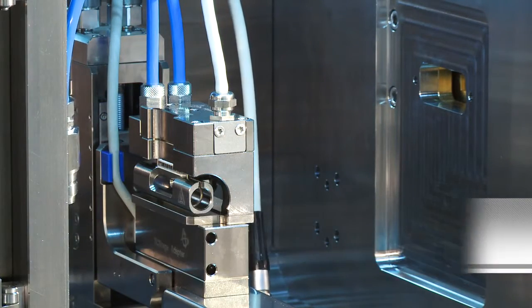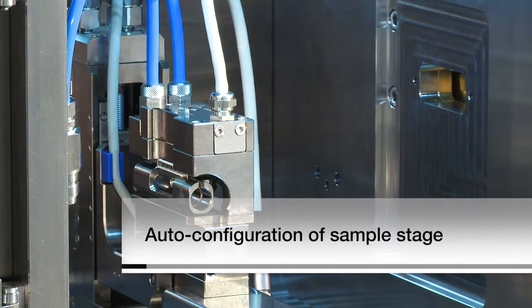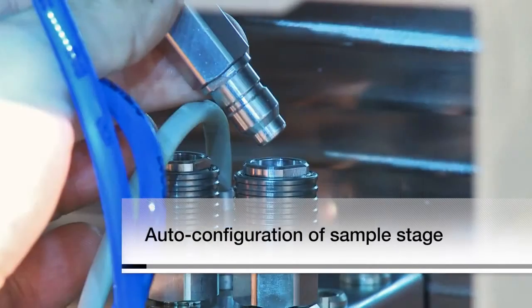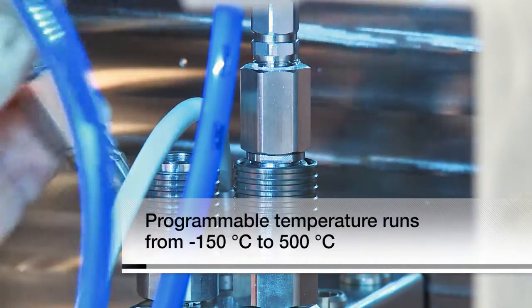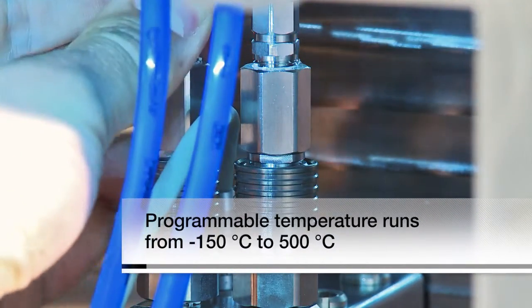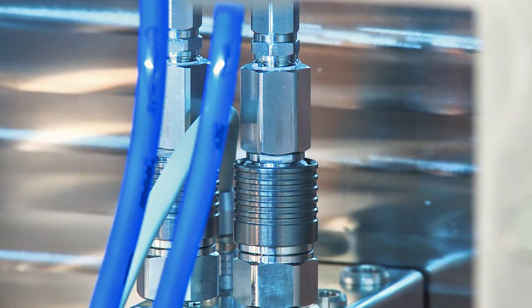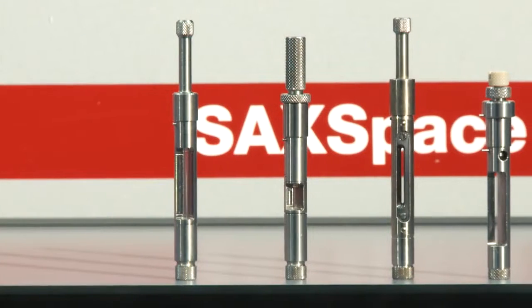Simply mount the desired sample stage for your experiment and load the sample. The SAXS drive measurement and control software will automatically configure all settings so you are ready to start.